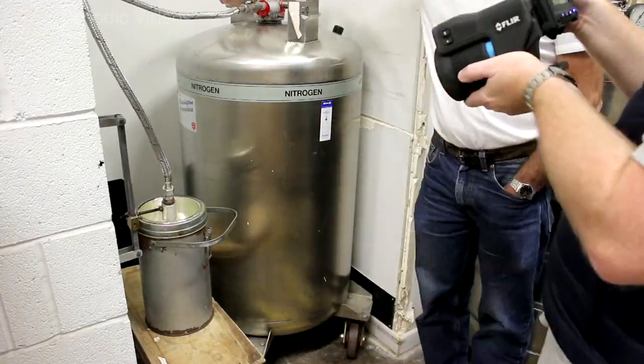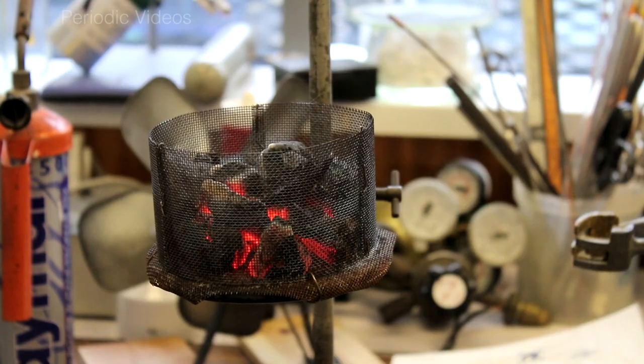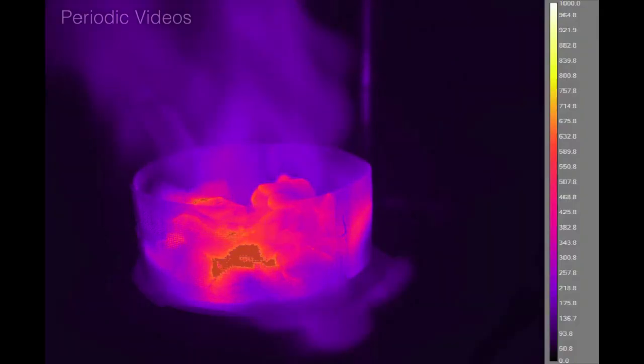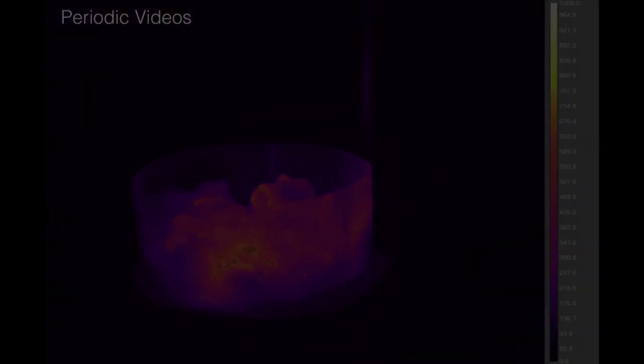We're going to show you how we do the experiment from the very beginning, and we're going to show it to you with a thermal imaging camera so you can see which bits get hot, which bits get cold, and even see some of the temperatures.